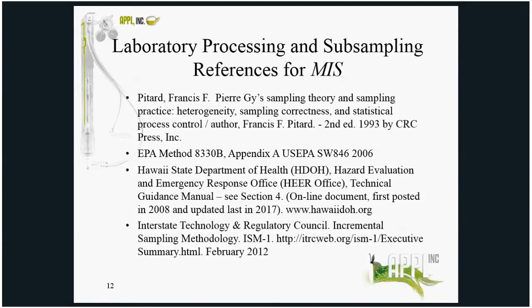There are multiple sources for MIS lab guidance, and they've been available for many years. Although they all describe MIS lab sample processing and subsampling methods, they do vary in detail. And there are particular issues with each that may need to be closely scrutinized or perhaps modified based on your project DQOs, the laboratory's experience, and maybe recent information.